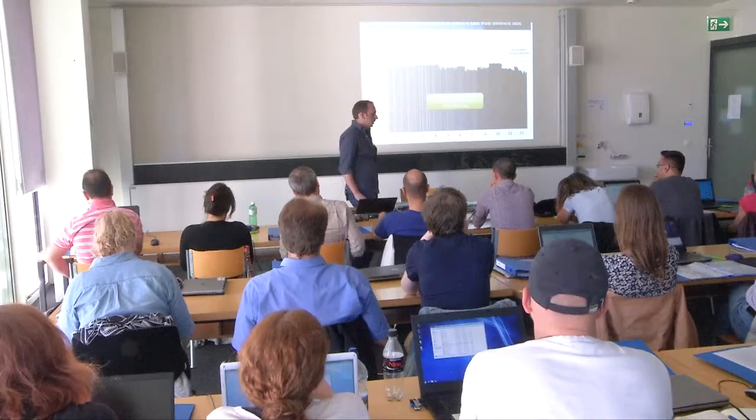So I would start by saying one of the reasons that drove people in the direction of SRM and smaller scale targeted proteomics is the question you asked. Can you do the same experiment across labs and get robust values? And this was the purpose of this CPTAC consortium in the States that Brendan mentioned was originally funding Skyline. They were sending around these standardized samples to different labs and checking if you do SRM measurements on these, do you get basically the same answer?